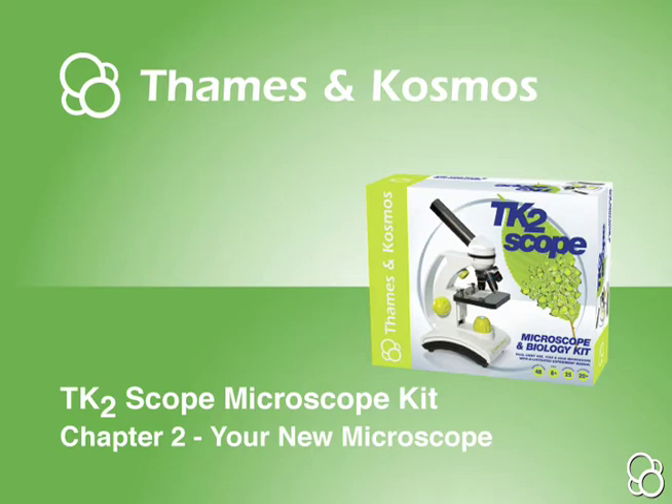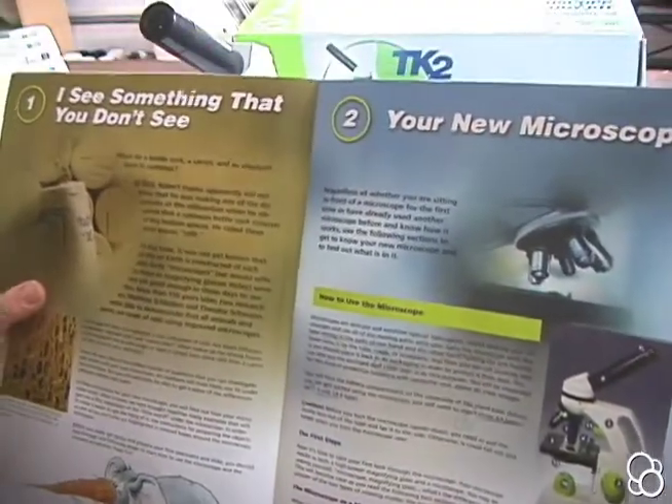We're going to go through a few important lessons in Chapter 2, your new microscope, about how to use the microscope.